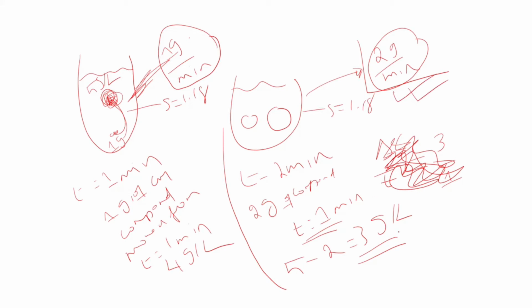So what we expect from this type of experiment, say you have supersaturation and time. If we start with one particle, your supersaturation depletes with respect to time, following this trend. And if you start with two particles, the depletion in supersaturation will be even faster, and then eventually it comes to the same point. This is the equilibrium point.